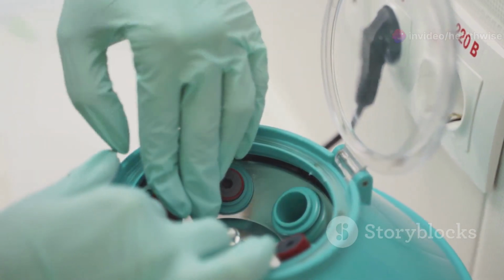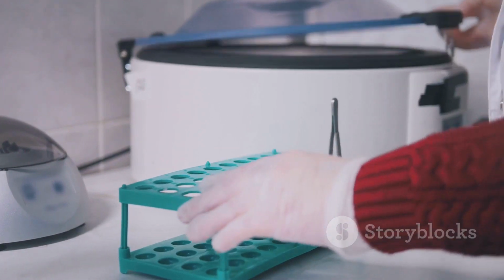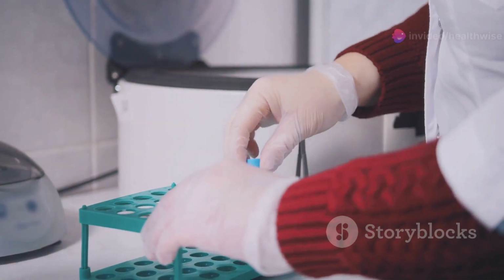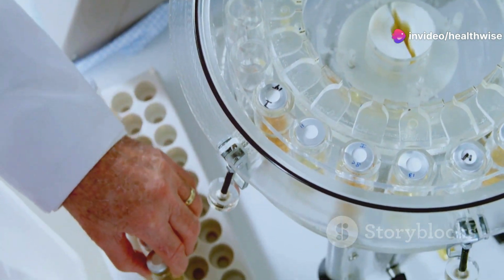Section 5. Spinning right. Operating a centrifuge. Using a centrifuge might seem intimidating at first, but it's actually quite straightforward once you get the hang of it. Here's a step-by-step guide to help you spin like a pro.